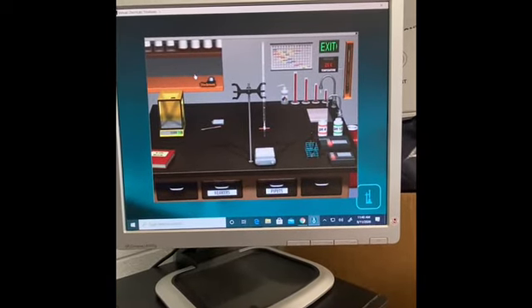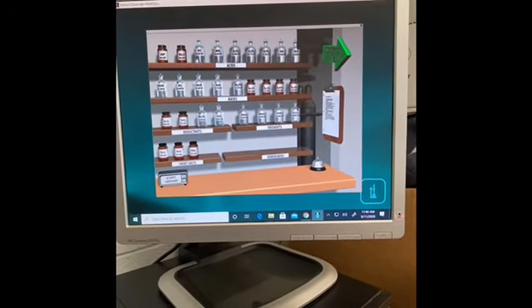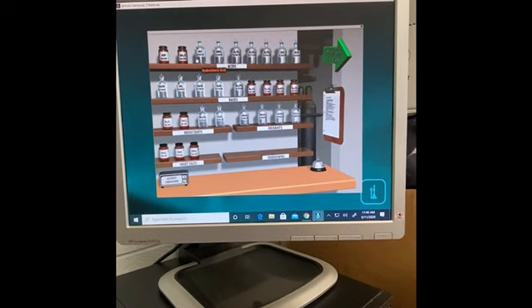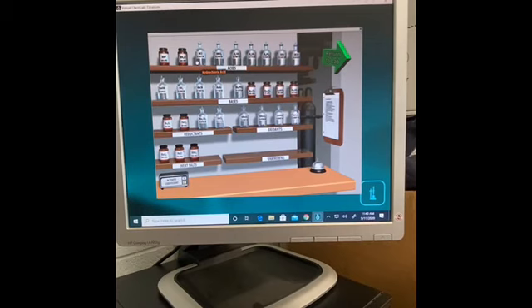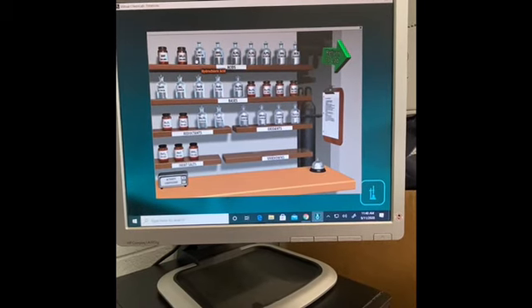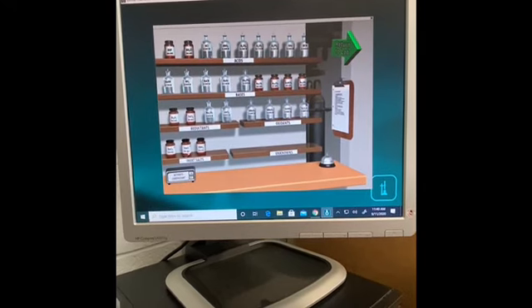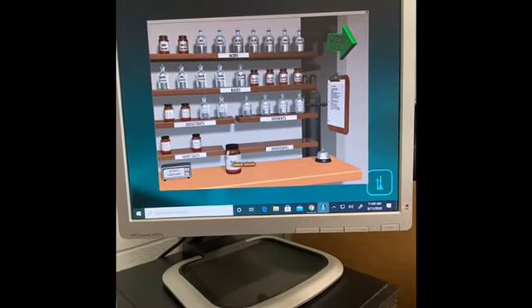Number 2, enter the stockroom by clicking inside the stockroom window. Once inside the stockroom, double click and drag 3 reagents: NaCl, Na2CO3, which is 100%, NaHCO3. So the first one is down here. NaCl. We're going to click and put it over to the highlight.